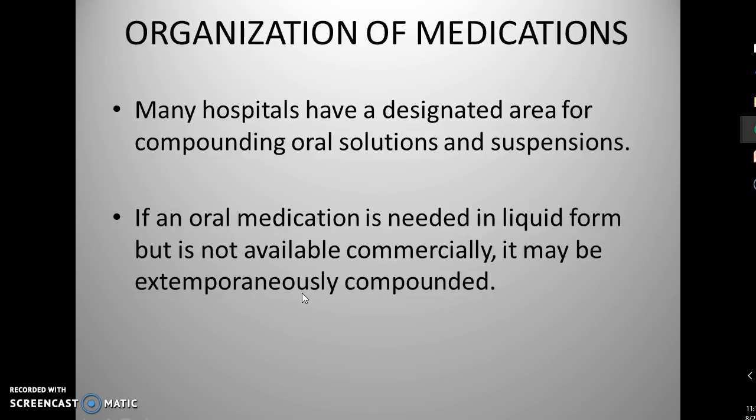All of the ingredients and supplies needed to make the drug solution should be collected and brought to the oral compounding area. This is true not only in a hospital setting, but also in the community pharmacy setting that we have talked about. Prior to preparing the medication, pharmacy technicians must first wash their hands and clean the surface to be used.